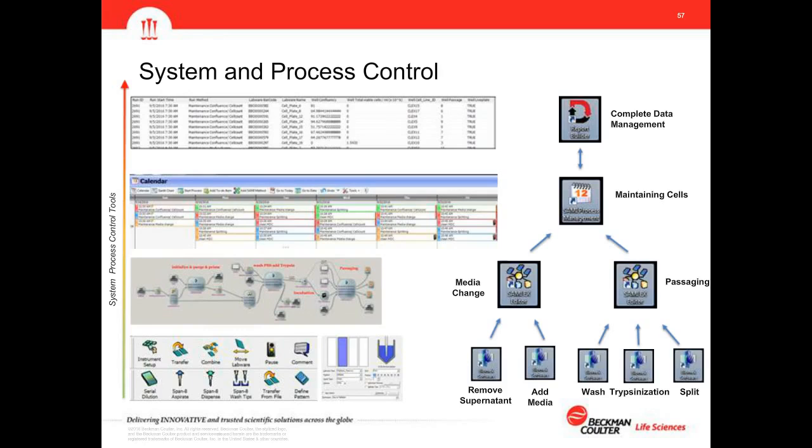They then together make a SAMI method, a scheduled method that takes multiple of these liquid handling actions into a method, and then multiple of these methods like media exchange and passaging make a process that is defined and managed in SAMI process management, and data handling in the background, just as we've seen in the NGS field, is taking care of all the data handling in the background. So it's really bottom up, taking care of all the details, but also taking care of the high-level process control.